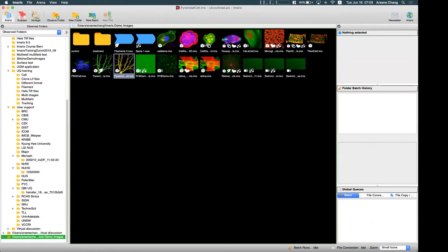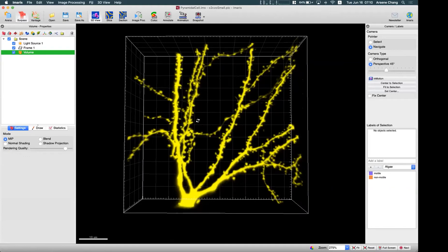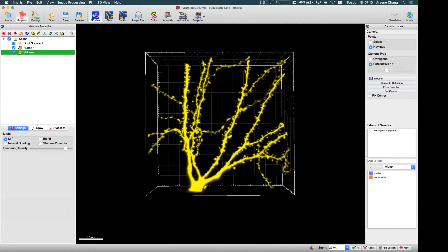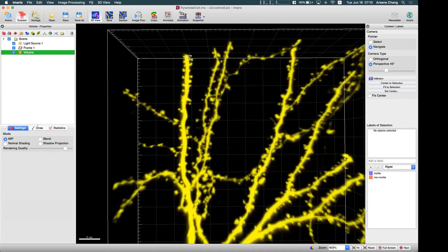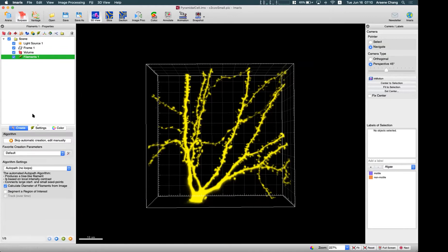Let's switch to Imaris to demonstrate how Filament Tracer works. I'm going to use this neural demo image to show how the auto path algorithm works on tree-like branching structures. This is a neural sample with dendrites and spines. If you want to calculate the length of dendrites and the number of spines, we use Filament Tracer. If you use Surface, it gives volume information from intensity but does not give length information or branch points — that's where Filament Tracer is needed.